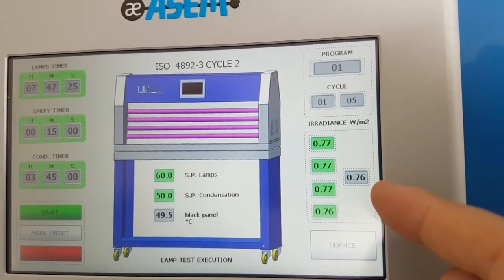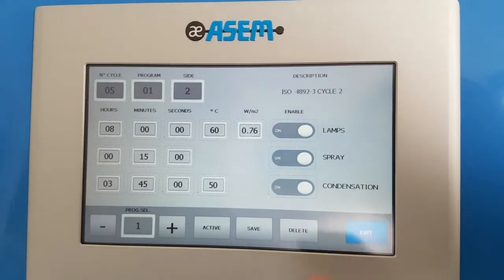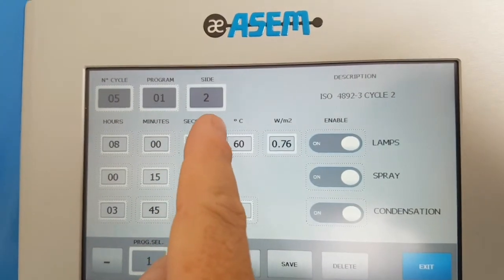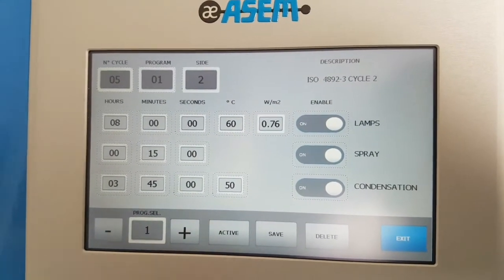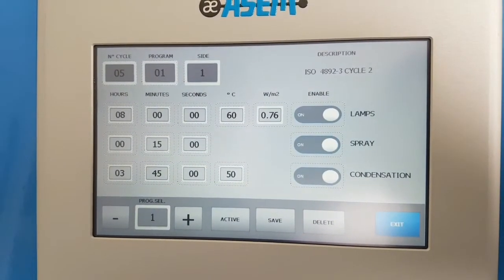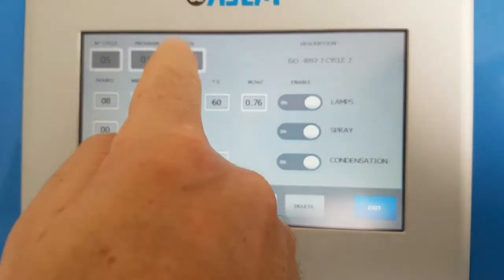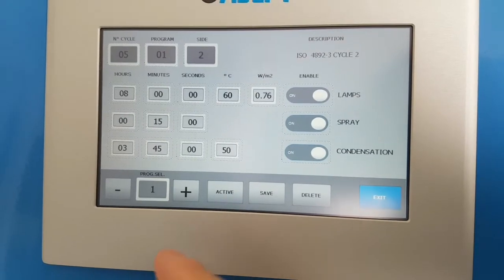The value shown is what you set in the program — if you re-enter the program you see 0.76 is the irradiance setting point. Number of cycles is five, program one. 'Side' means that both sides of the lamps are working — front and back. You can also select only one side, meaning only the front, to save energy and not use the back lamps. Usually it works on both sides — entering two means both front and back.